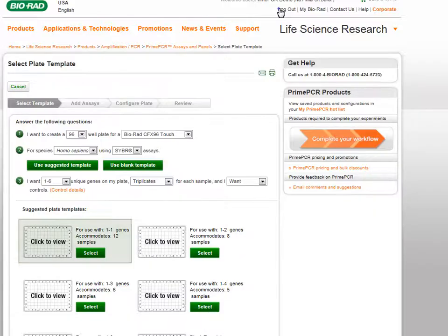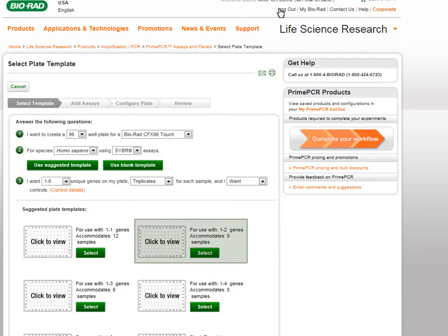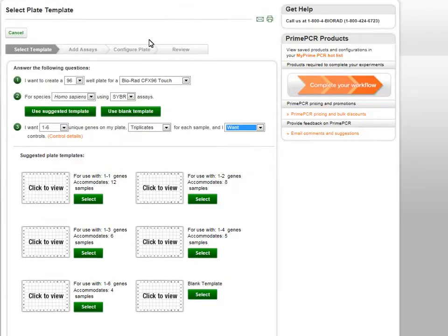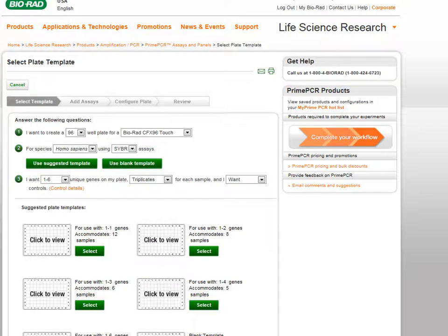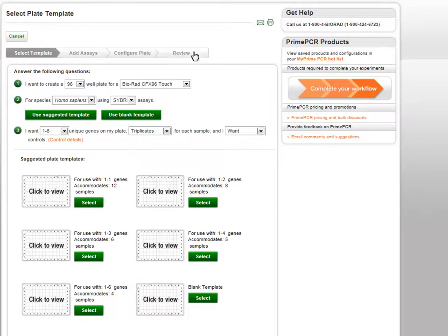Based on the answers to these last few questions, suggested plate templates will be presented at the bottom of the page. You can click on the plate icon to view the respective plate layouts. Once you have identified the plate template you would like to use, click the Select button to load the template into the plate builder.